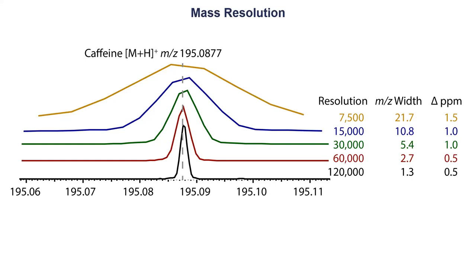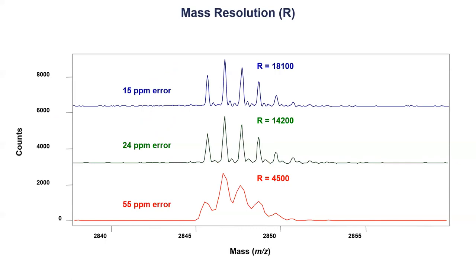And in this case, there's nothing surrounding it or interfering with our compound, which is not a problem. But if you look at this plot here, you see with different mass resolutions that at one point we get to a point where we can't easily separate the masses anymore, which is then a problem. And if you then think that you may already convert your profile data to centroid data, based on the centroiding algorithm, you will already combine some peaks that you would maybe still see separated in profile mode, but based on the algorithm in the end you see only one. Maybe shifted, and you think it's something else, and that's why it's sometimes good to have the profile mode.